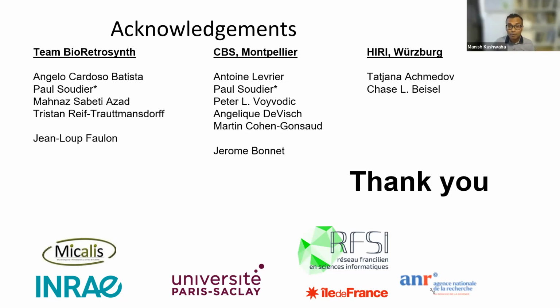Yeah, no, for us, we saw this mainly when we pre-expressed GAMS. When we purified it, in fact, because now I don't know if it's something to do with the optimal amounts of GAMS to add, because in our case, we first optimized it. So we picked the one where we got the best protection. And perhaps that's why in the final data, we don't see it. Maybe that could be a solution. If you have purified GAMS, you first find the optimal for it, because perhaps there are batch-to-batch differences even in the production of GAMS.